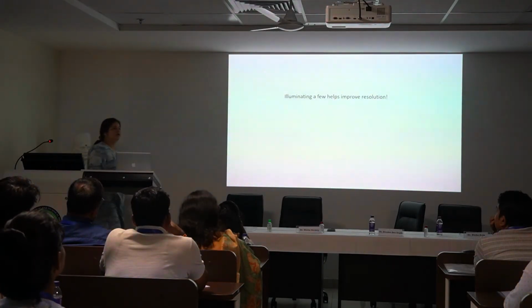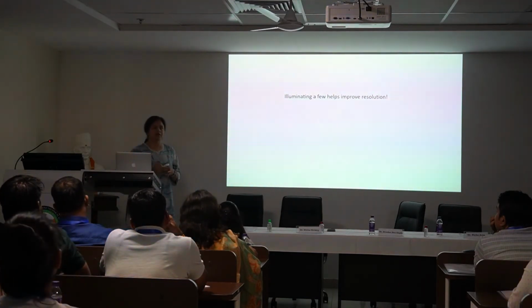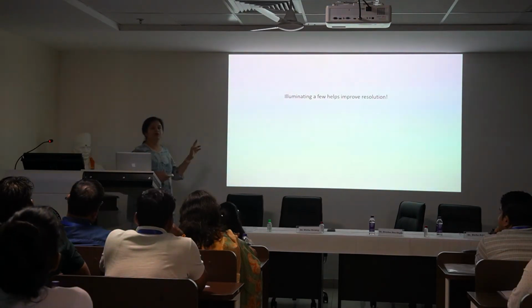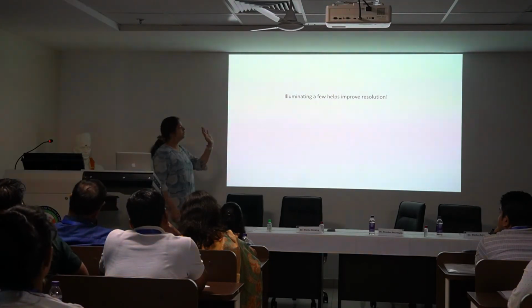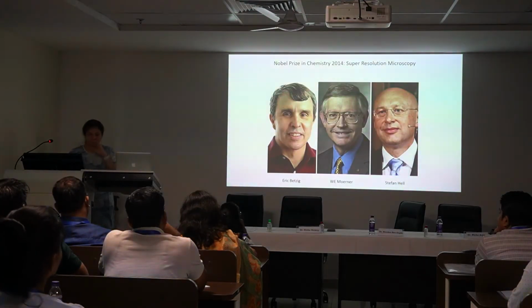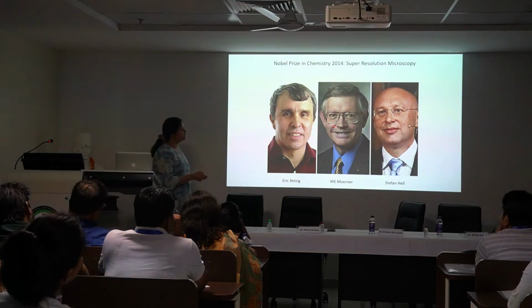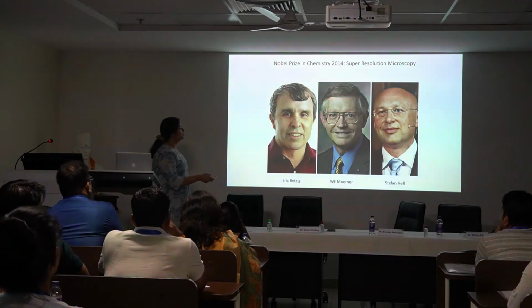Okay. So in summary, what you've seen now is a hardware-based solution. The hardware has a depletion laser which is converting the molecules into a dark state and allowing for improving resolution. So it definitely, hopefully, convinces you that if I illuminate a few, then that will improve resolution, right? So that hopefully convinces that point. Now, super resolution actually very quickly got a Nobel Prize after the work of these three scientists, and Stefan Hell is who I spoke about, and the STED microscope is what you just saw previously.